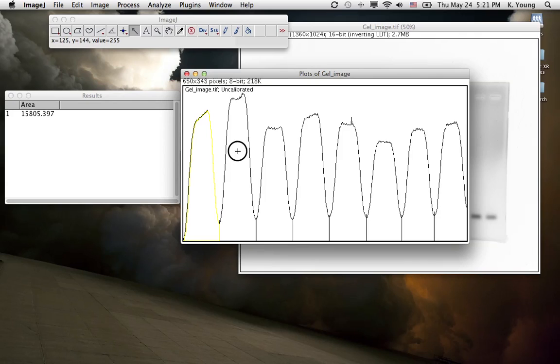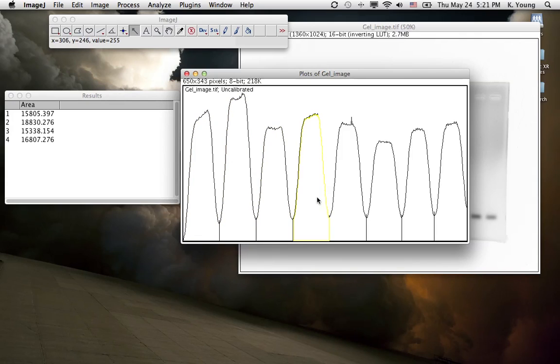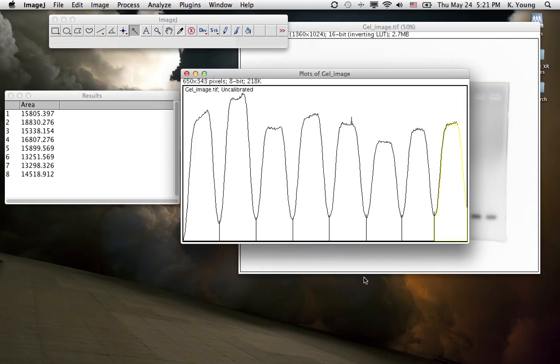It assigned this first peak an area of this value. Then we want to go to the second peak, third, fourth, fifth, sixth, seventh, and eighth. And now there's values assigned to all of these.